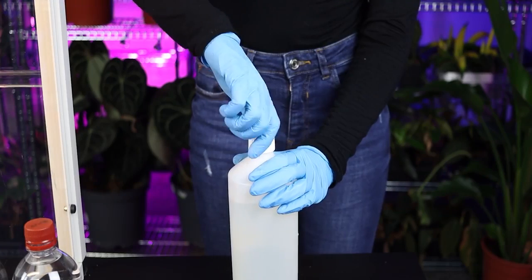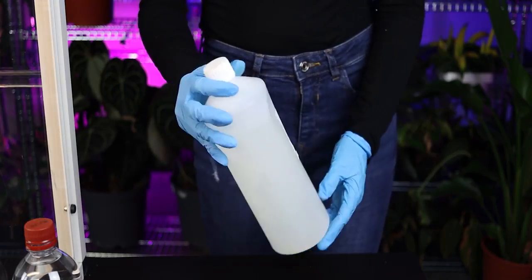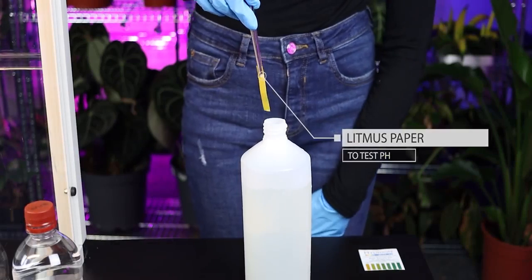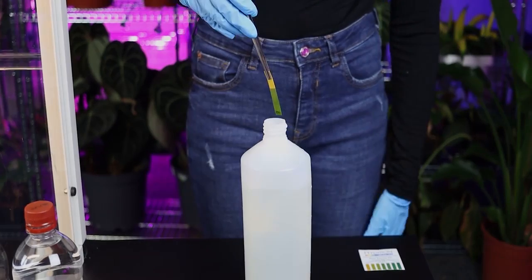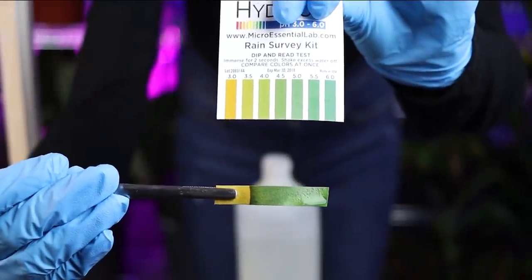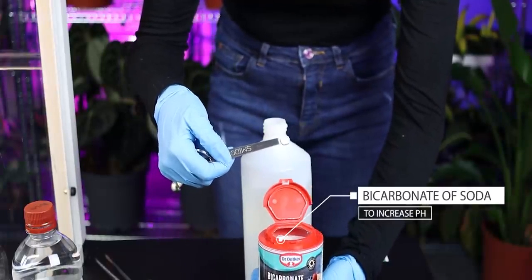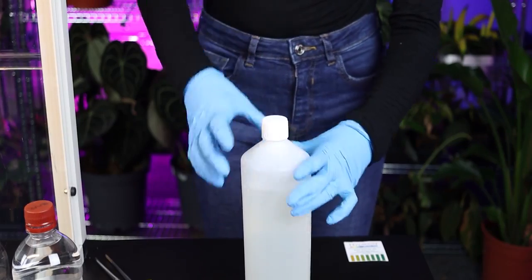Once this is mixed, I'm giving the solution a quick shake in order to thoroughly mix the ingredients. I'm then going to check the pH. Now this needs to be between 5.5 and 5.8 in order to ensure we have optimal conditions for nutrient uptake. Should we find that our pH isn't quite where we'd like it to be, we can always add a little bit of vinegar if the solution is too alkaline, or bicarbonate of soda if it's too acidic. This should bring the solution to an acceptable pH that we can work with.